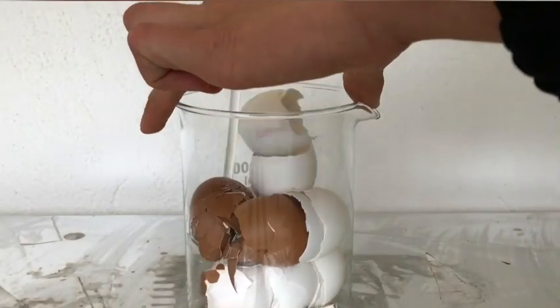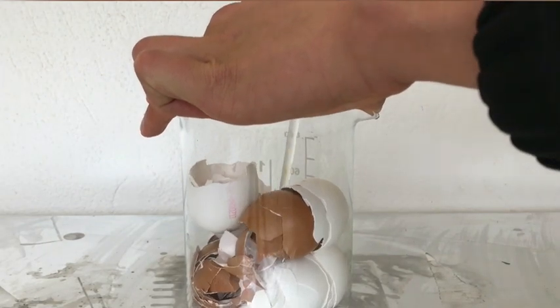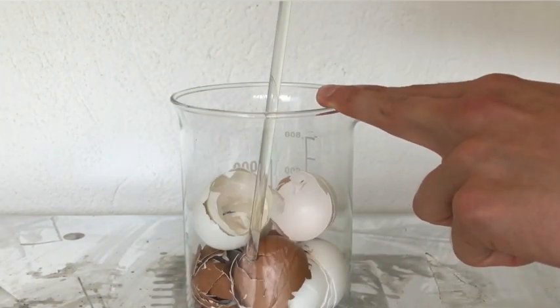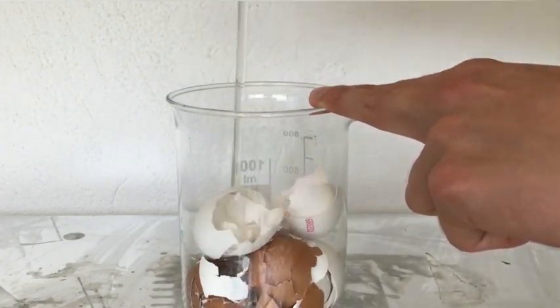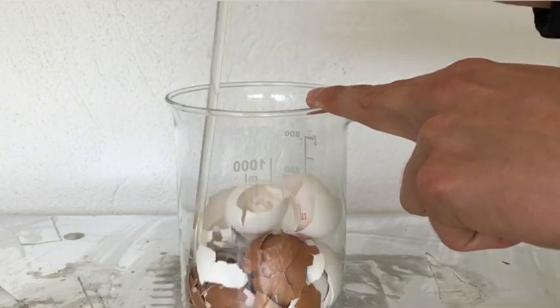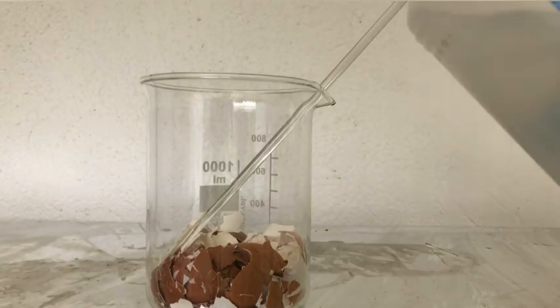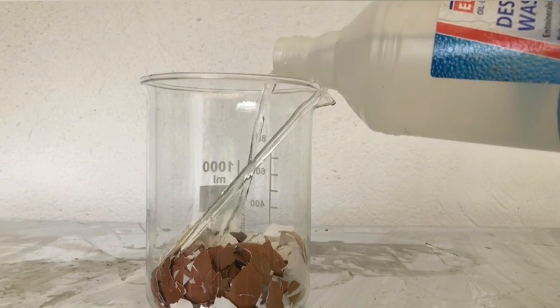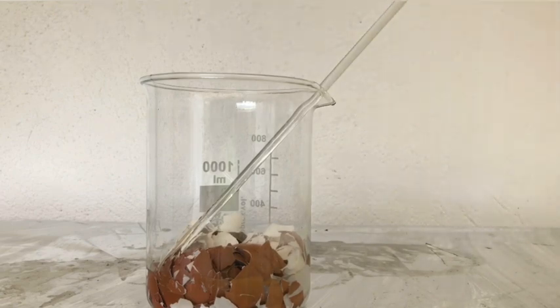We first crushed all of the eggshells down into the beaker to maximize the surface area and to speed up the reaction. To the eggshells, just a little distilled water was added to cover them all up because our acetic acid is a little too concentrated.